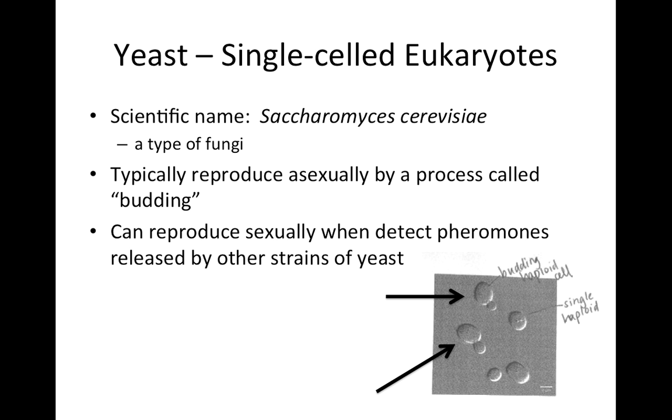In this lesson, I'm going to talk to you about the cell communication lab and give a better explanation of what's going to actually occur. For this lab, we're going to be working with yeast. Their scientific name is Saccharomyces cerevisiae. The type of yeast that we're working with is just like regular baker's yeast, but we will have two different strains of the yeast. There's an A type and there's an alpha type. Those are two different mating types, so when they come in contact with each other, they will try to mate.